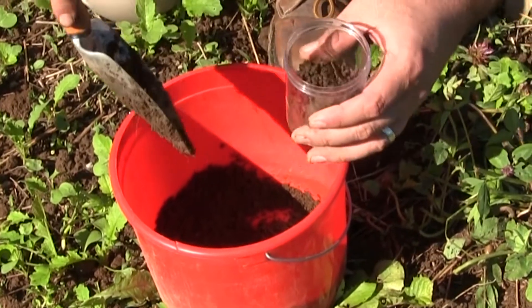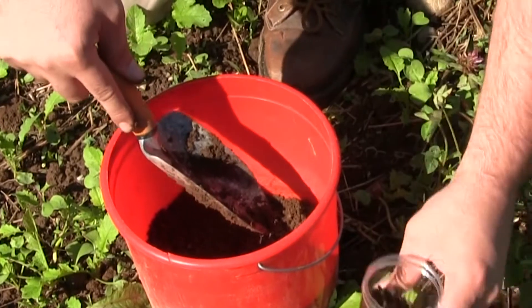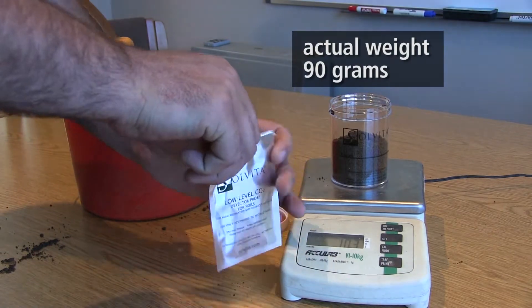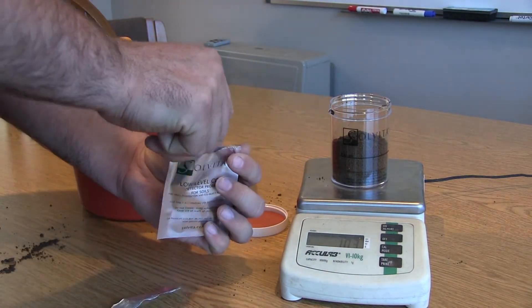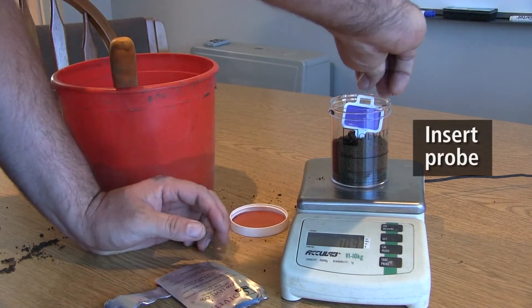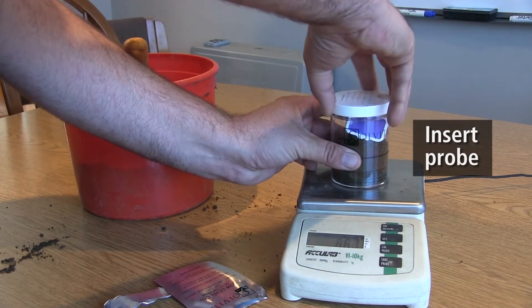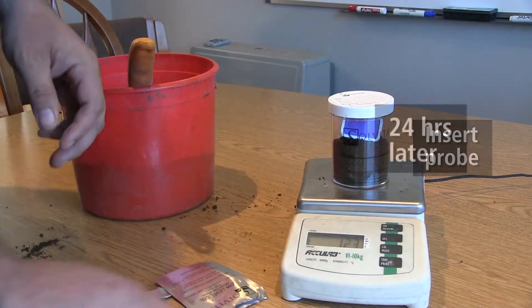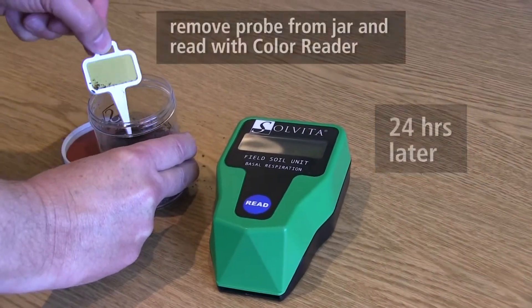It's more material than we could possibly need. Out of this we could actually run several tests. We need a hundred grams — here we go.